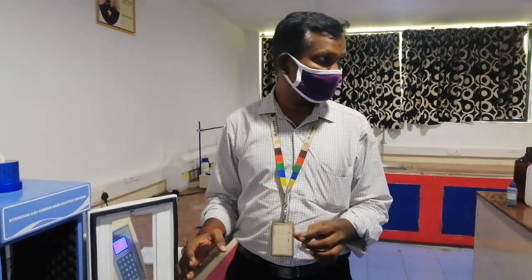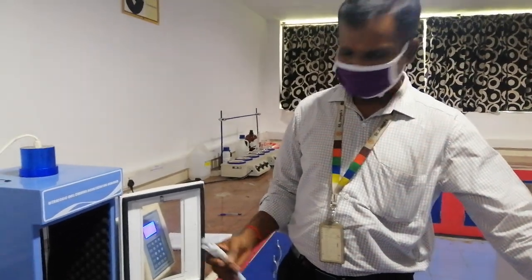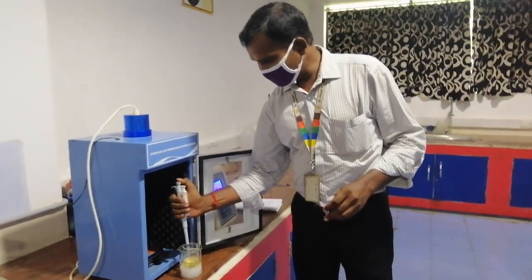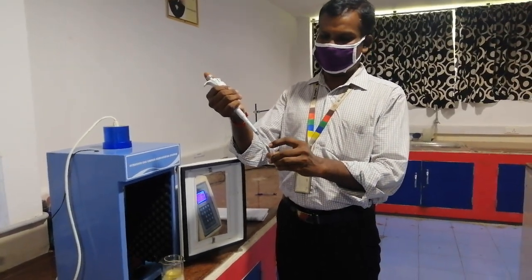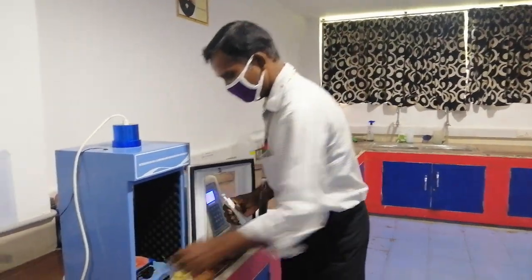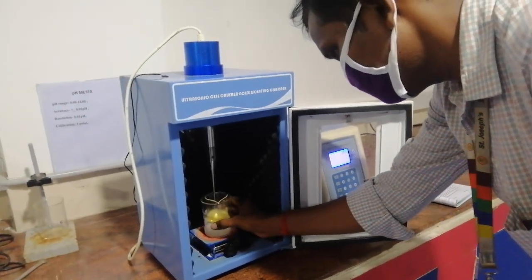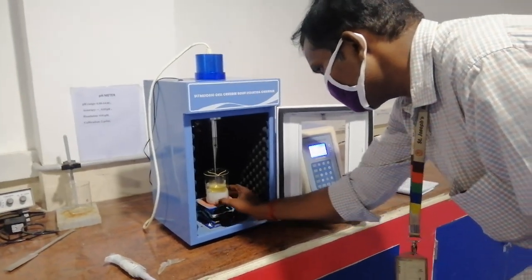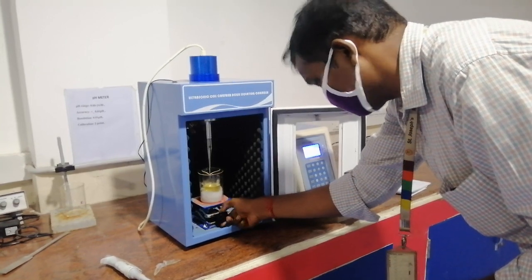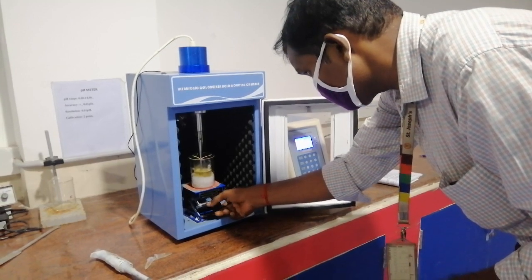The cycle time is 30 seconds. So first we have completed the first cycle. Now we are going for the second. You have to use the micropipette to collect the sample. 0.5 ml is enough, otherwise you can go up to a maximum of 1 ml. So now the sample is collected for the first cycle, and then again keep your sample inside the chamber just above the platform, and then adjust the platform height. Therefore this ultrasonic probe will get immersed in your sample, but ensure that your ultrasonic probe does not touch the bottom of the beaker or the side wall of the beaker.